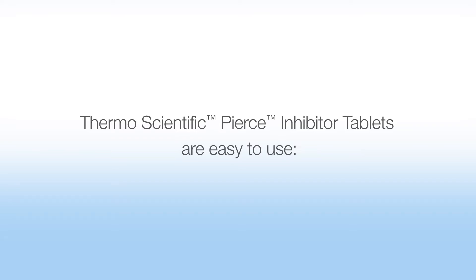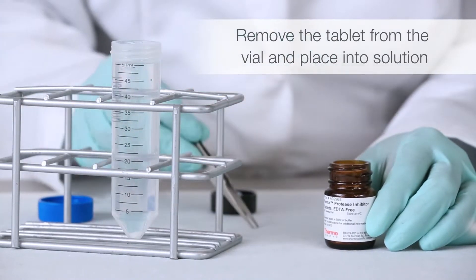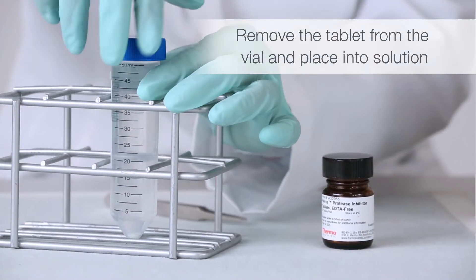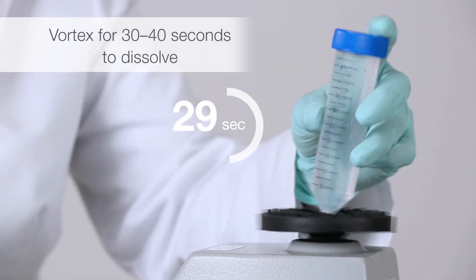Thermo-Scientific Pierce inhibitor tablets are easy to use. Remove the tablet from the vial and place into solution. Vortex for 30 to 40 seconds to dissolve.